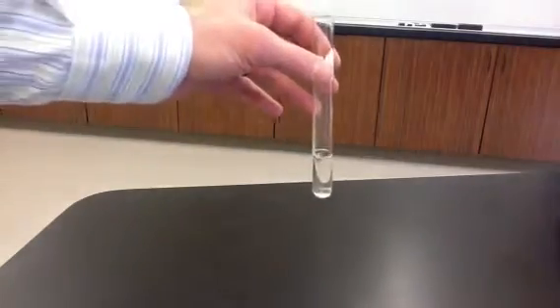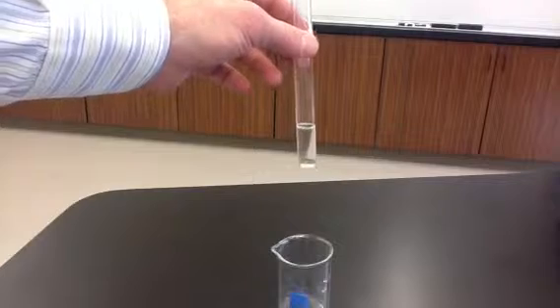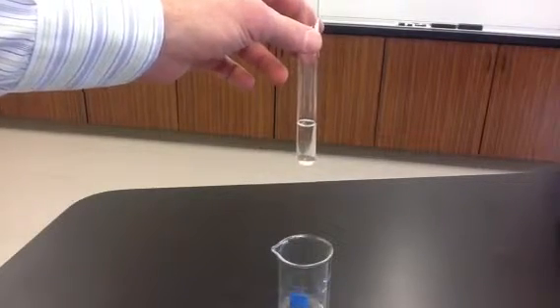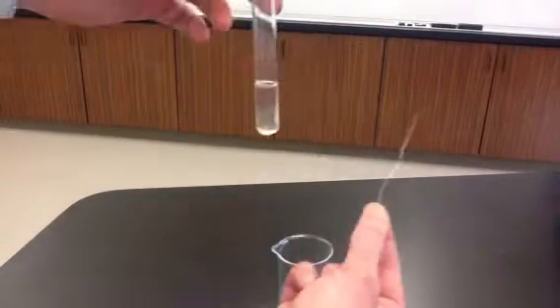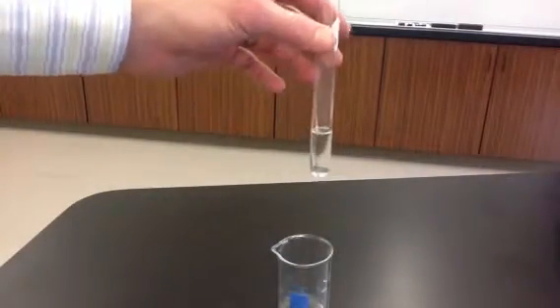Our third reaction is going to be a reaction between silver nitrate. So this is silver nitrate. It's a colorless solution. Silver nitrate is soluble in water. And then we're going to add to that a piece of copper metal. So this is a piece of copper wire. And I'm going to drop the copper wire into the silver nitrate.